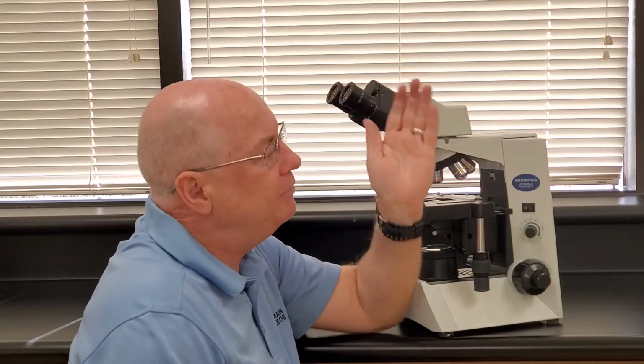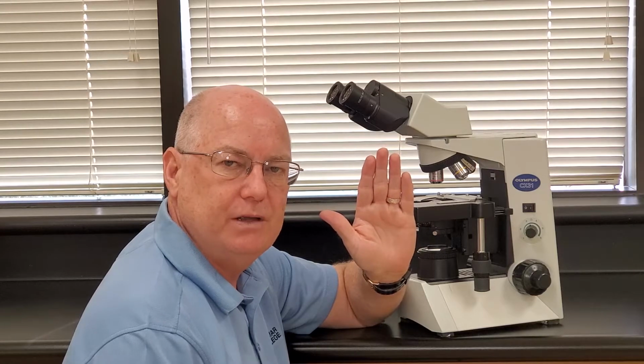So if I asked you guys to read my fingerprints from where you're at, you can't see them. So what you might say is, hey, Mr. Long, move your hand closer so I can see your fingerprints. And if I started to move like this, about 1 millimeter every 5 minutes, we would be here all day before you see my fingerprints.